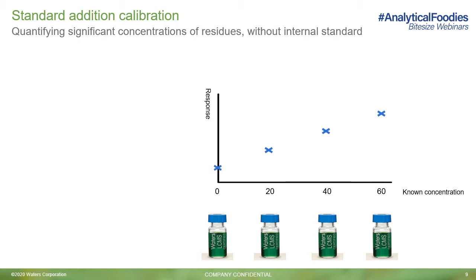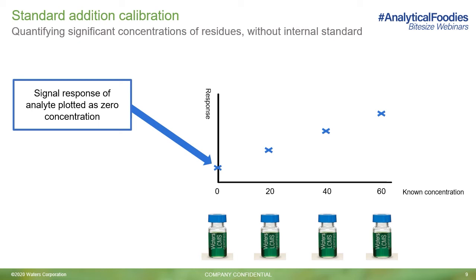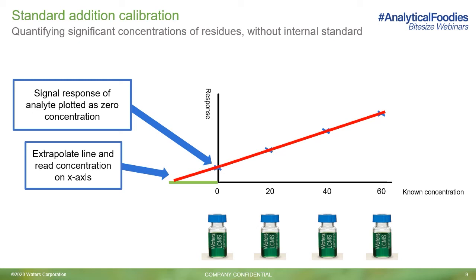Because the standard addition plot is using the incurred sample to build the calibration curve, this becomes our lowest calibrant. Once a linear line is created from incrementally equal additions, the curve's line is extrapolated onto the x-axis and the concentration of the incurred residue is back calculated. Building this calibration curve assumes a concentration of the incurred residue has already been estimated, and the curve built off this concentration is linear over at least 3 subsequent standard additions.